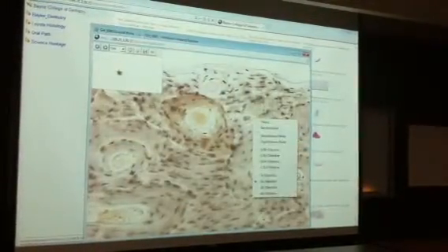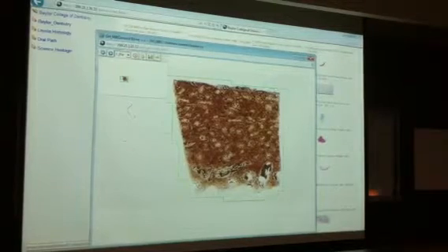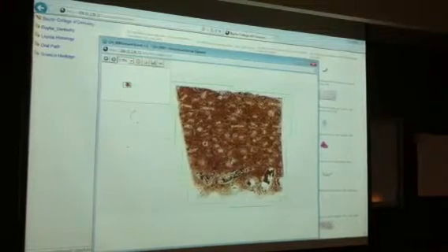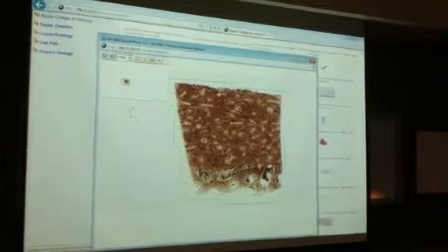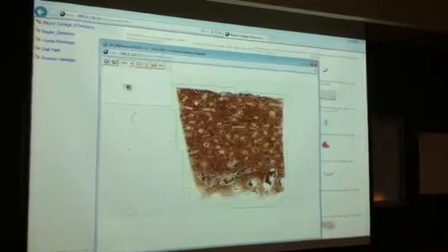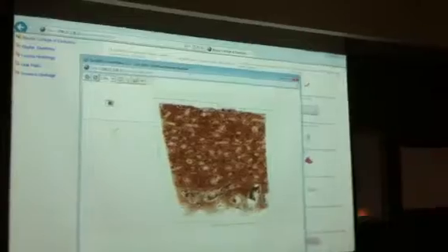Okay. You need to know the difference between the inside and outside of the bone. When you look at this, you see a smoothened outer surface and a more roughened inner surface. It's also where you're going to find your blood vessels, because that's where they come into the bone. When you magnify, you'll be able to see that the material in here is where your inner circumferential lamellae would be, and your outer circumferential lamellae would be out here. Okay, related to outside of the bone, inside of the bone.